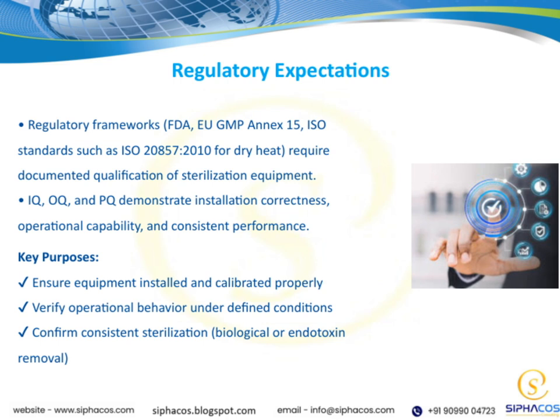When we perform IQ, OQ, and PQ, we're covering three key phases: installation qualification, operational qualification, and performance qualification. IQ ensures that the equipment is installed correctly and calibrated properly right from the start. OQ then verifies that the equipment operates as intended under specific, defined conditions. Finally, PQ confirms that the equipment consistently performs its sterilization functions, whether it's biological or endotoxin removal.